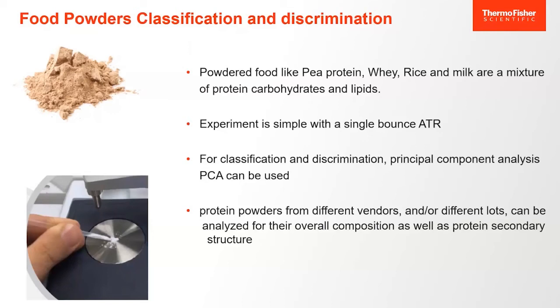In the next 2 slides, once we look at the data, what we are going to look at is how powerful it is to use a PCA-based analysis of these powders to basically use it for classification and discrimination analysis.